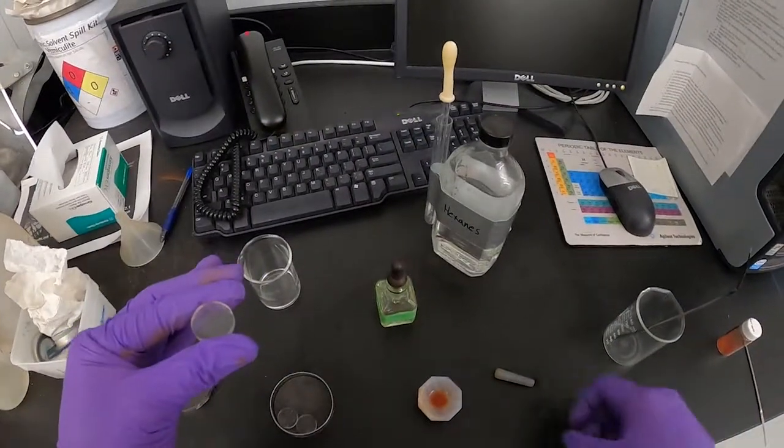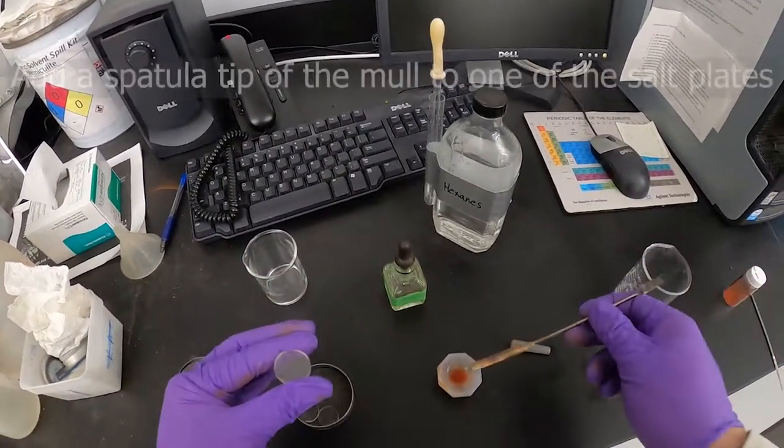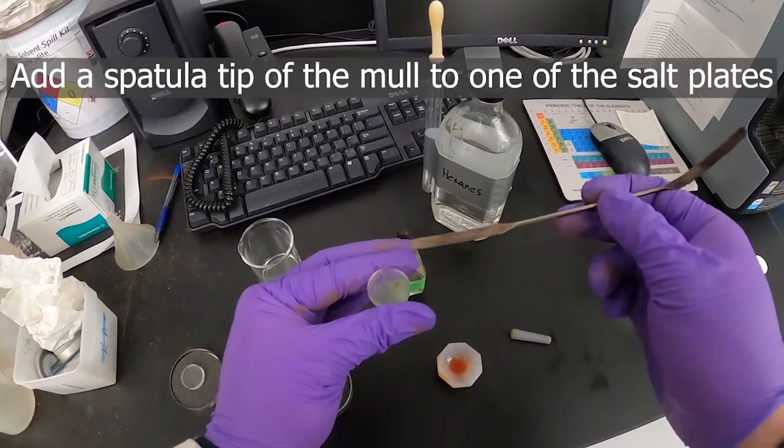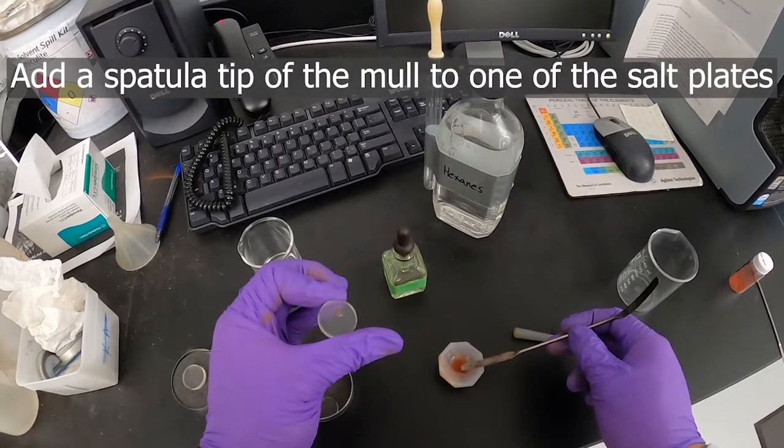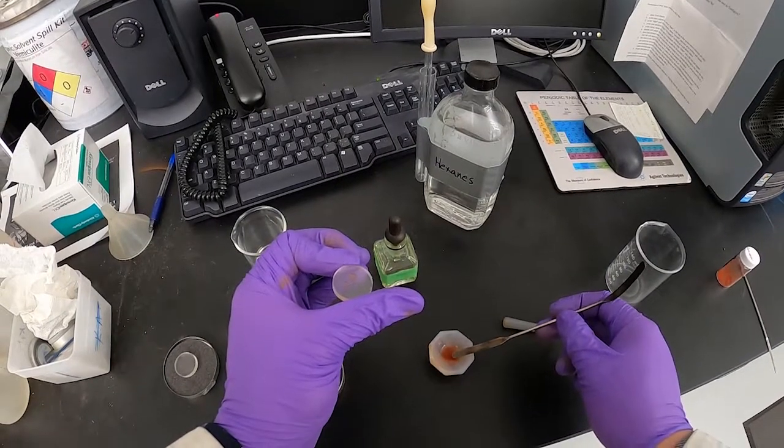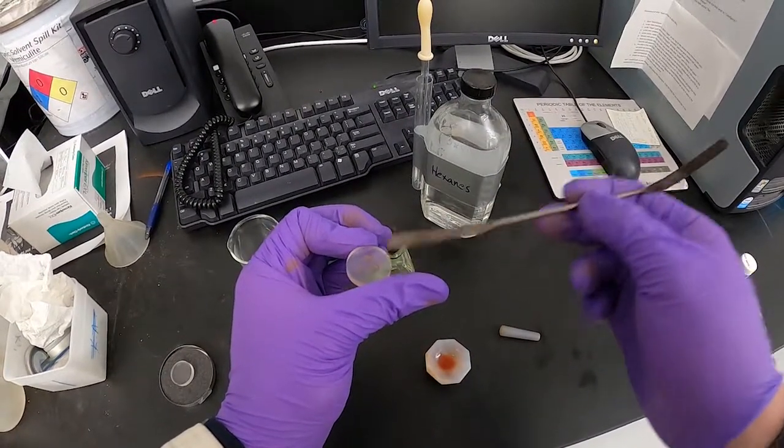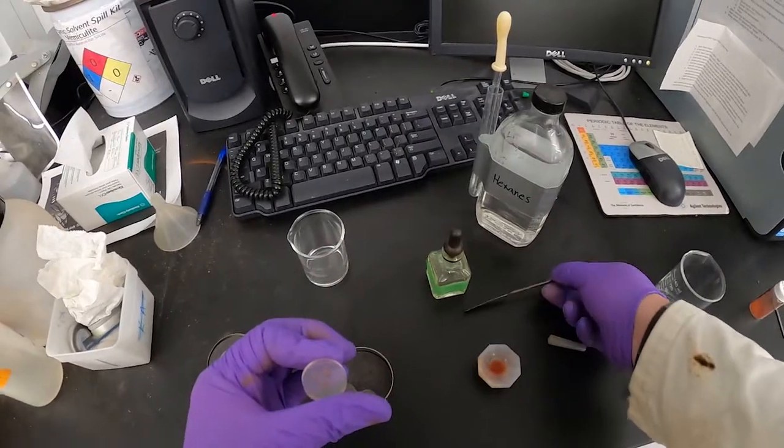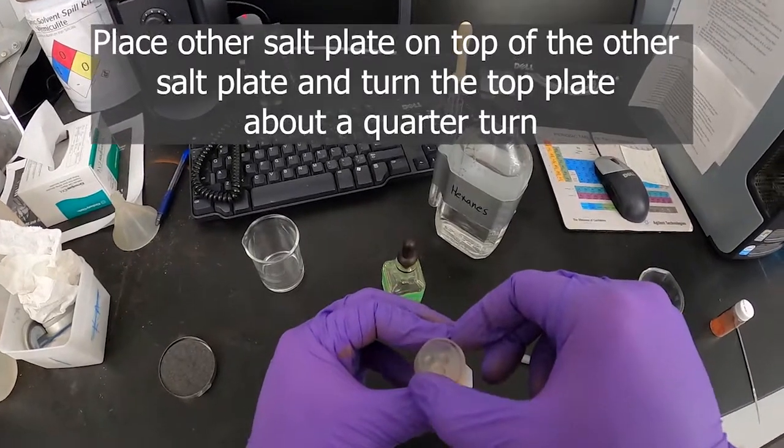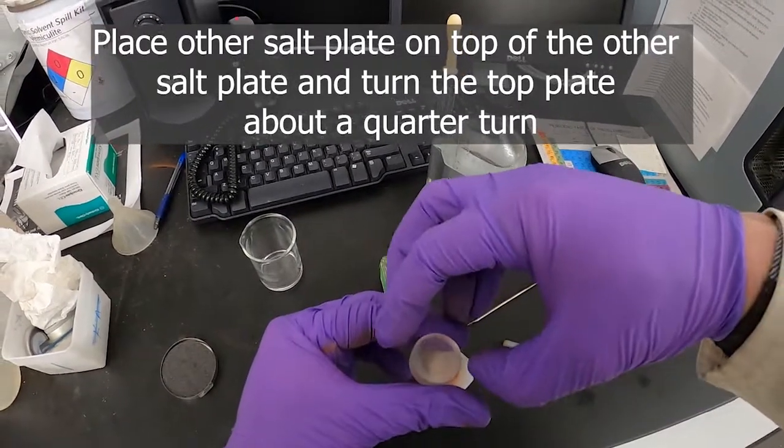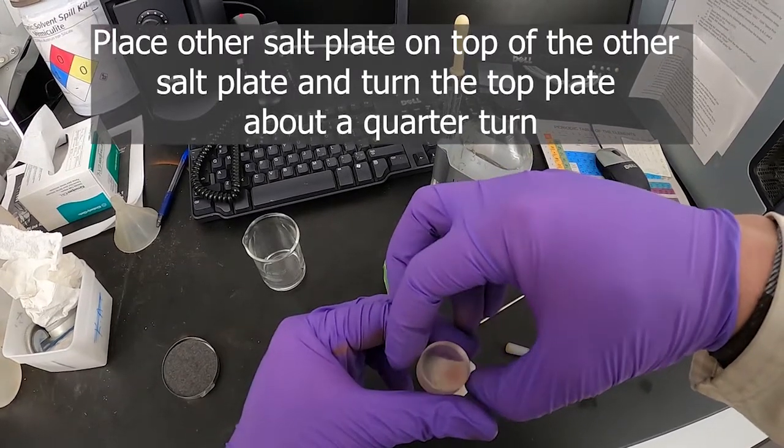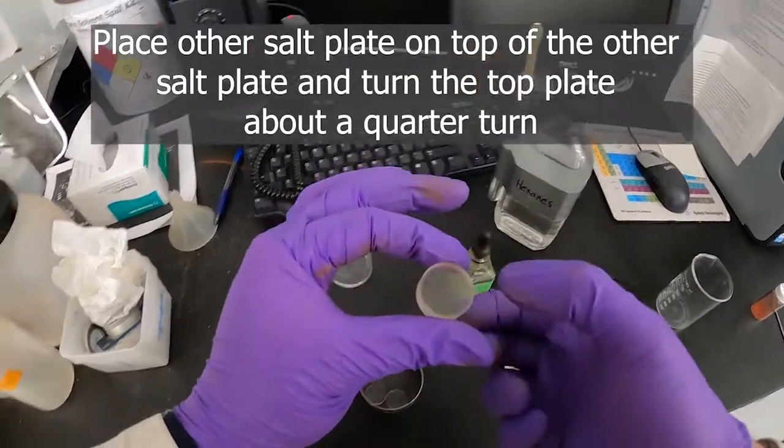All right, we'll take our spatula here, a little bit of our mull here, put three extra drops on there. Take our other plate, put some on there, and turn 90 degrees or so to get that mull spread out between the plates.